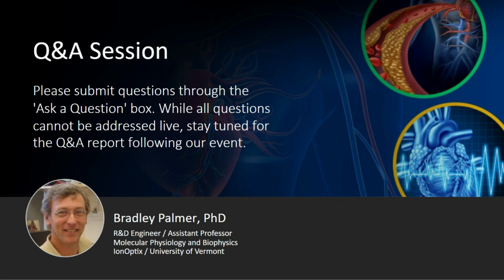Natalie's question says, at which temperature is the work loop acquisition possible? We've done it at room temperature, and we've done it at 37 degrees C. We've tried in between. We've tried 30 degrees C, but so anywhere from room temperature to 37 C, complete success in any of those temperatures. Perfect. Next question.